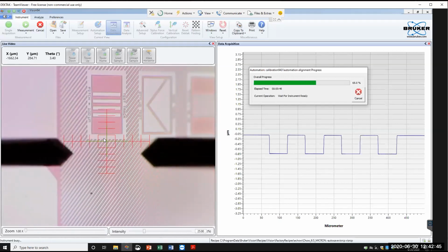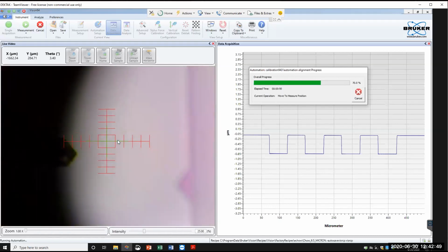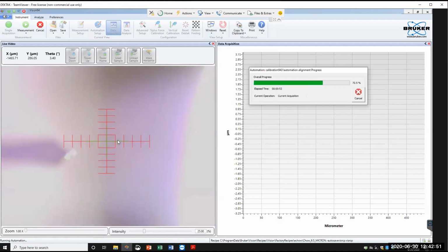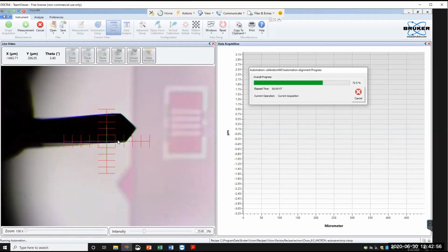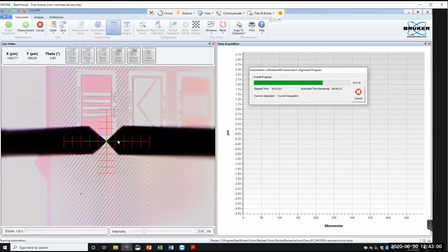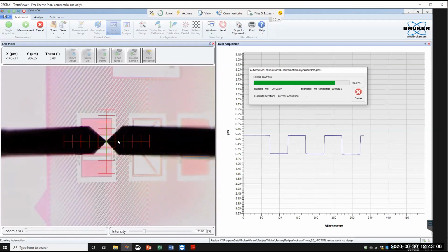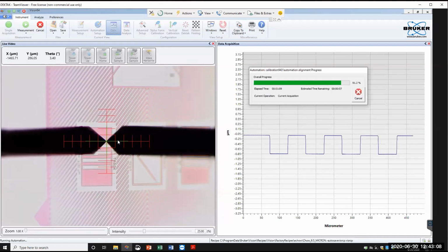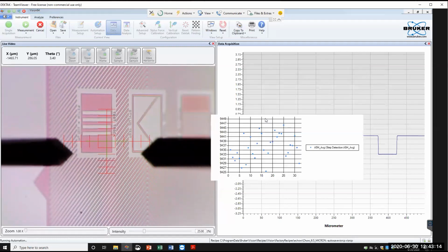So it will move to the next point here. All those points are designated by the user, and then you can save it in your automated recipe. And that way, if you have some calibration test point in your sample, you can choose to go to exactly the same point and use that to allow you to get better statistics. So after I finish the measurement now, then I will click OK.